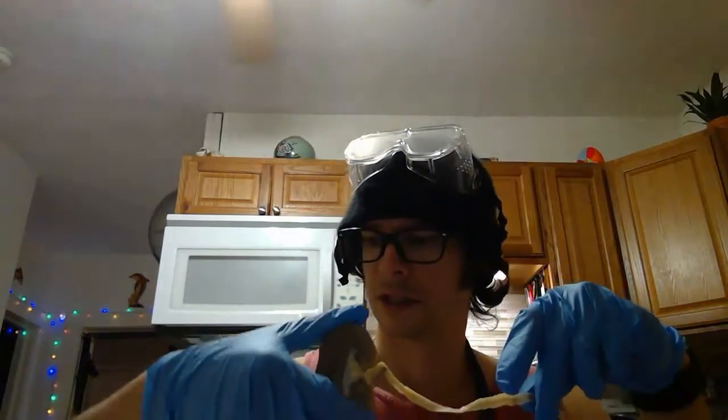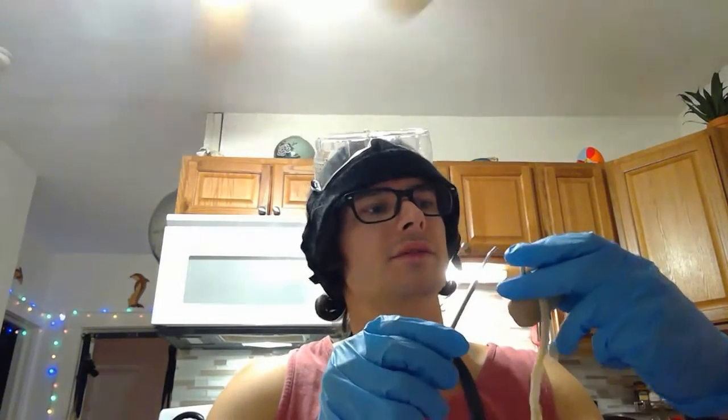My apologies. And so right here, the lighter color on the outside, as we go in from the capsule, would be the renal cortex, and then we have the renal medulla, and then there are some pyramids here, as you can see, and the minor calyx. About 4 to 5 of them join to make a major calyx, and those are right here, and they meet up to make the renal pelvis. So right here, it's hard for me to tell, but I have a renal artery and a vein.